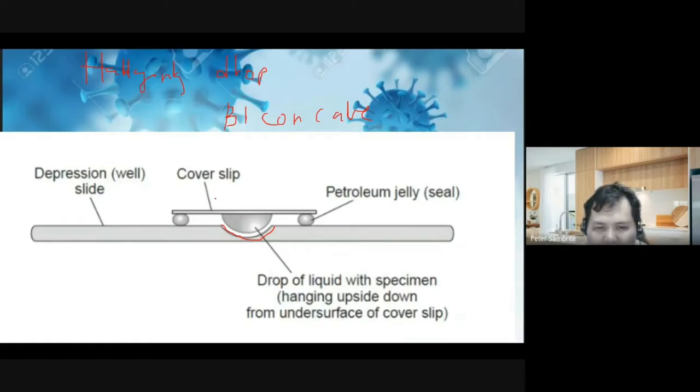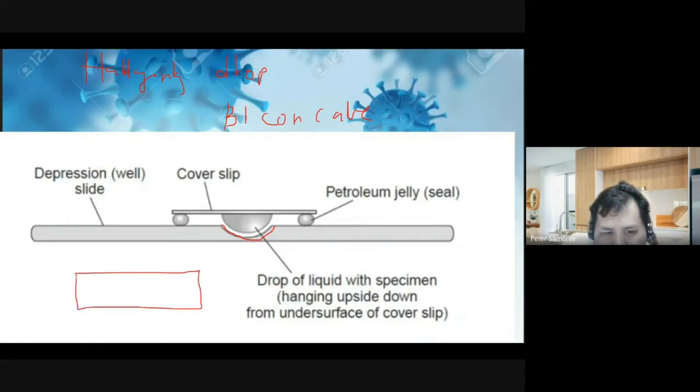But this time, prior to adding the cover slip, you have to place a sealant known as petroleum jelly. So imagine if this is your slide, class, then this is the depression. So you're going to add a cover slip. Prior to adding, you have to make sure that the sides have petroleum jelly.